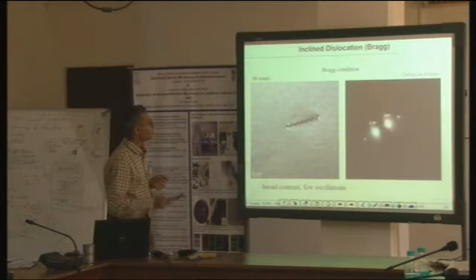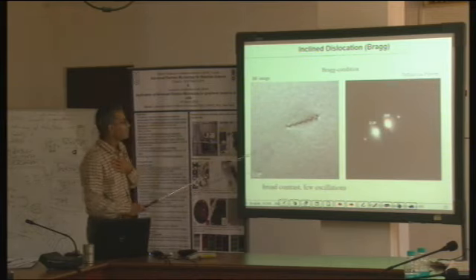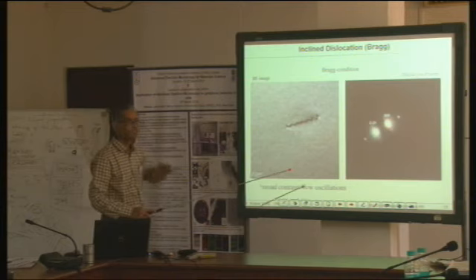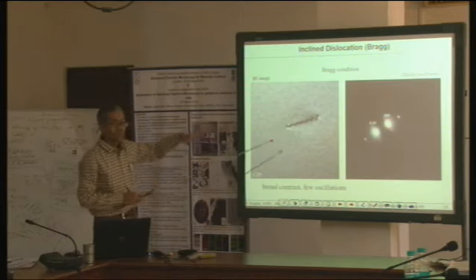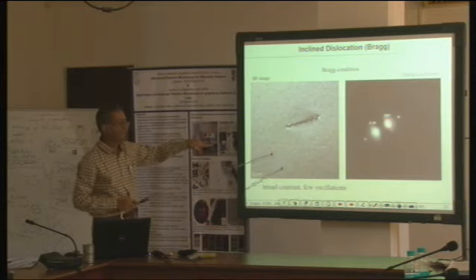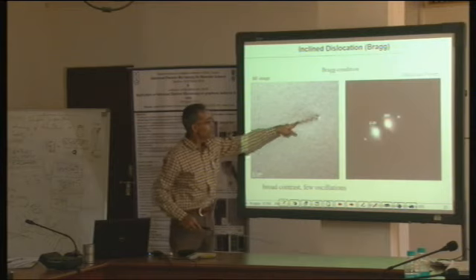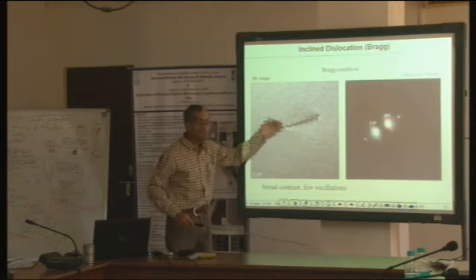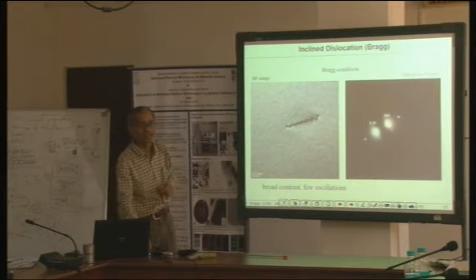Here again, this is a dislocation showing zigzag contrast. This is because that dislocation was inclined. It is thermodynamically not favorable that a dislocation will follow such a zigzag path. It only appears like that because of something like the inside-outside contrast that we saw.